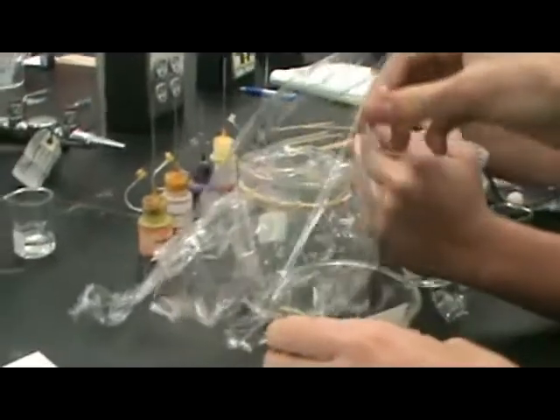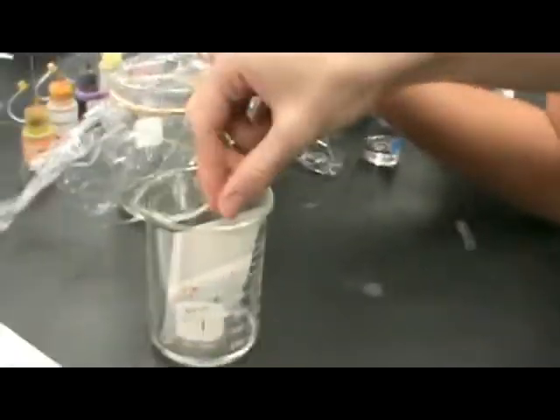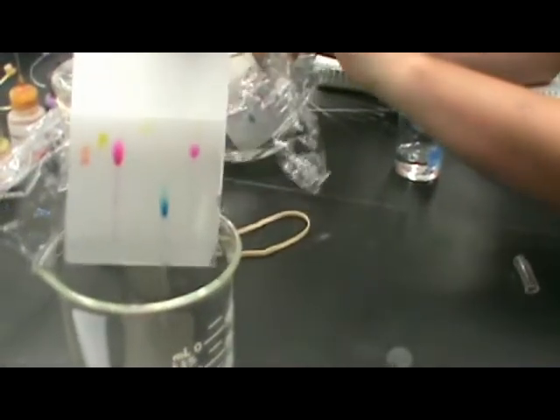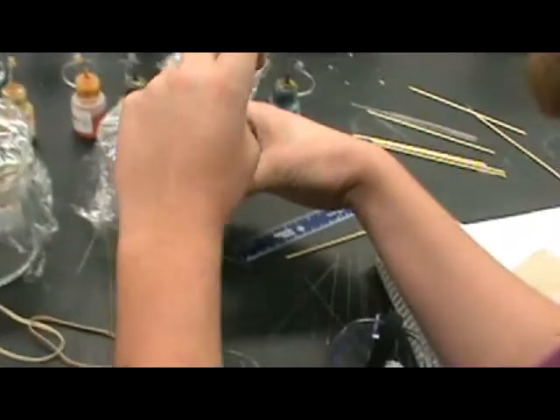Hey, you're supposed to have it now. We're done with two of them. The solvent has traveled enough of a distance to show its mark. But we are leaving one of them, which is solvent 2, alone because it has not changed that much compared to solvent 1 or solvent 3.